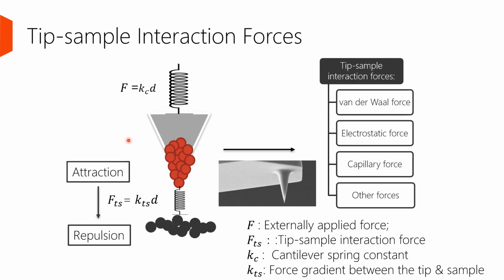So the examples we just talked about are quite simple. In fact, tip-sample interaction forces should be considered. There are a whole bunch of tip interaction forces when the tip is very close to the sample.